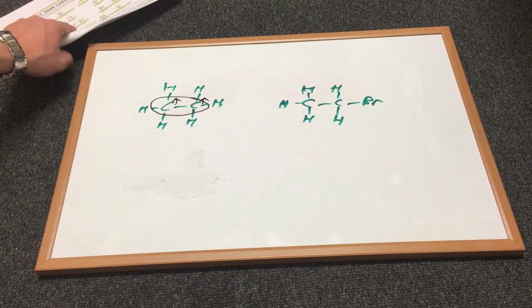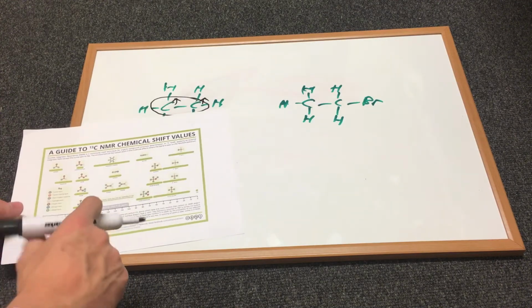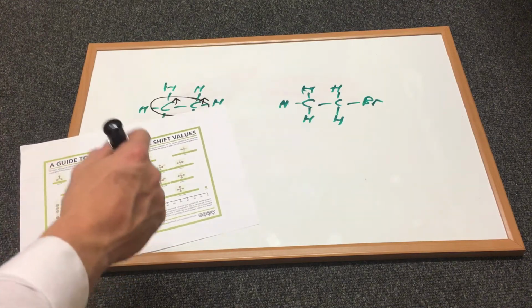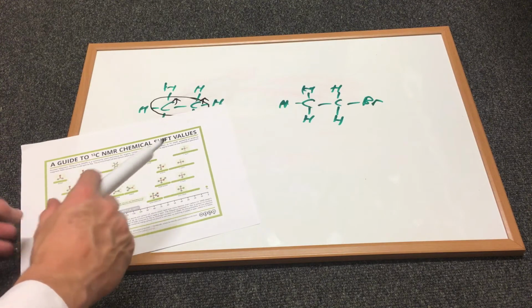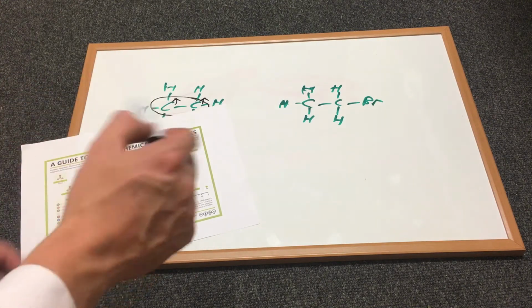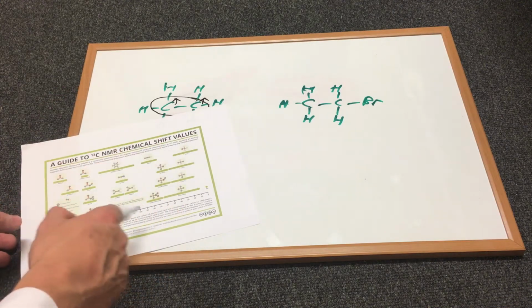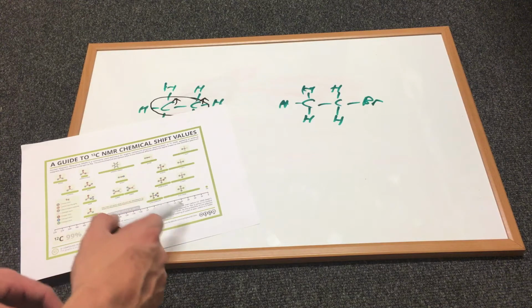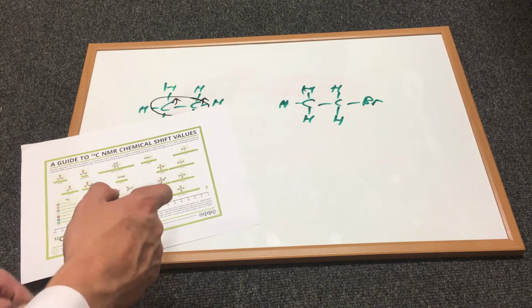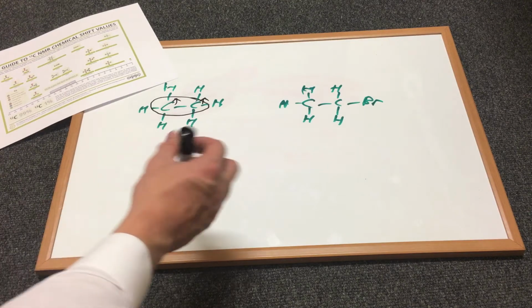Using the chemical data sheet, we can look at what structures are found at certain chemical shift values. Chemical shift values represent the amount of energy needed, in parts per million, to flip the spin state of the nuclei in that certain group. It's like a benzene ring or an alkyl group or an alkyl halide group. So our molecular example here, ethane.